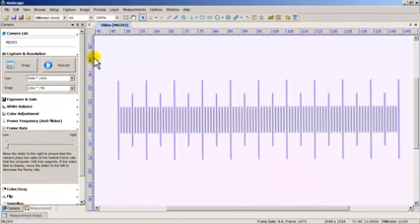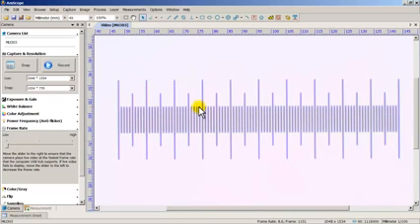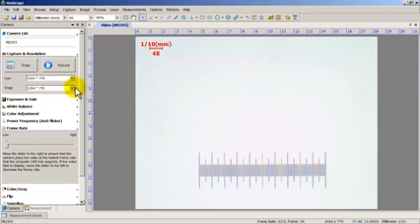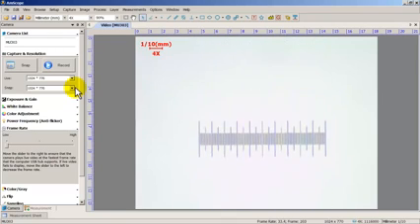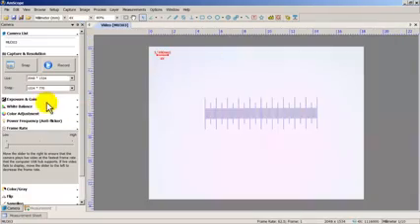So right now I'm going to go ahead and basically readjust and try to do the 10x objective now for calibration. So usually for this part, what I do is I lower the magnification back to the lowest one or middle one, so 1024 by 770. The only reason why I changed that is so that I could move it around freely, make sure it's good. And now I'm going to go back to 2048 by 1534.